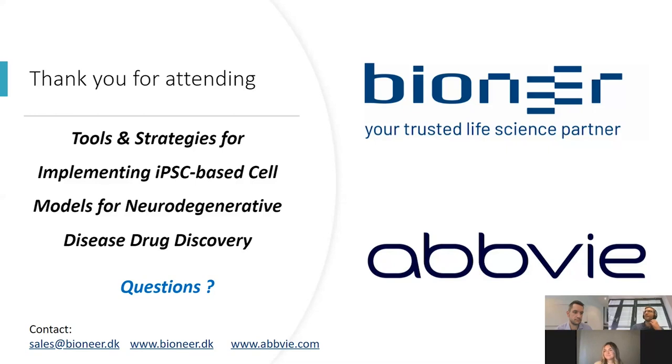Yes, that's an interesting one. Of course, these cells will talk to each other. One of the purposes of doing that co-culture system, and one very nice example here, is the microglia cells. These are not added as microglia cells, but as macrophage precursors, which are primitive monocyte-like cells that, just by the clues from the medium and from the neighboring cells, transform into a microglia-like and quite microglia-comparable state. Yes, this is clearly going on. So that also means that they affect the differentiation process.